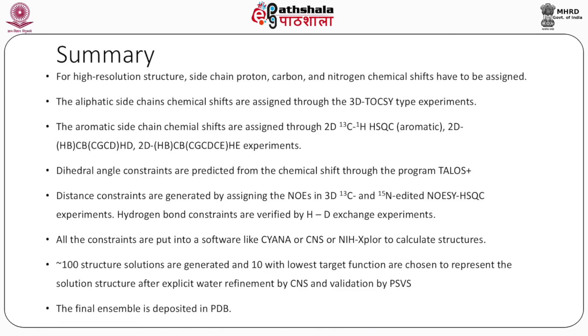Dihedral angle constraints are predicted from the chemical shift through the program TALOS Plus. Distance constraints are generated by assigning the NOEs in 3D C13 or N15 edited NOESY HSQC experiments. Hydrogen bond constraints are verified by HD exchange experiments. All the constraints are put into a software like CYANA or CNS or NIH Xplor to calculate structures.